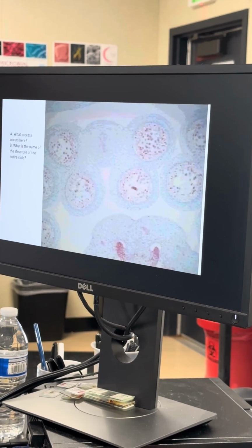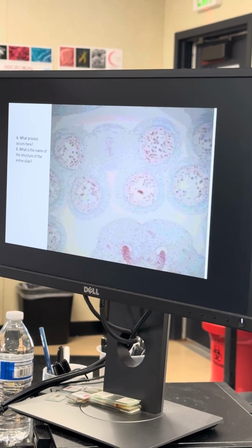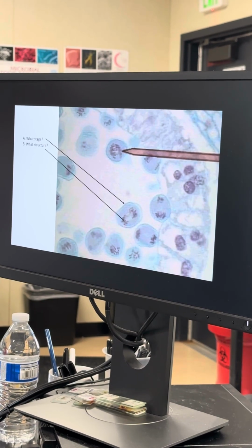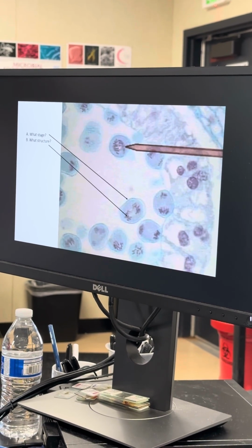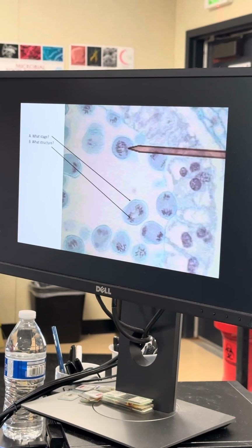Okay, lily anther, I cannot see any stages. I might ask you what is the part of the plant. I have been asking you on these quizzes. Anaphase 1. All of these are anaphase 1. Nice, beautiful anaphase 1. You do not write down 1, I will not give you credit.